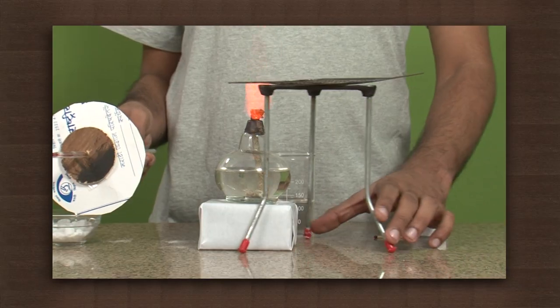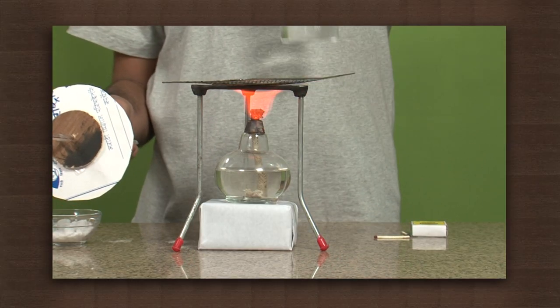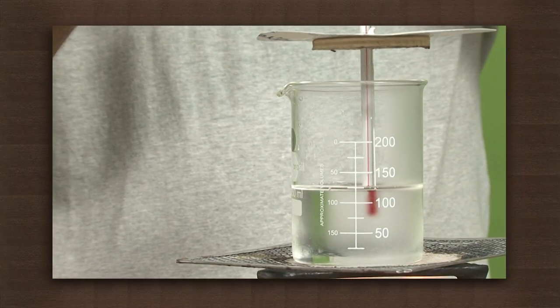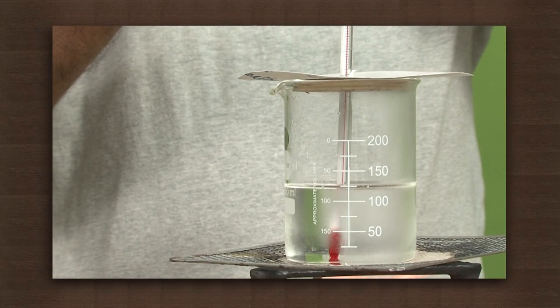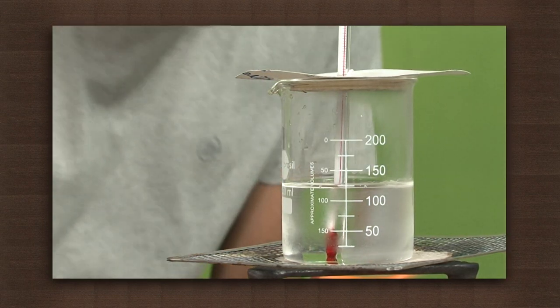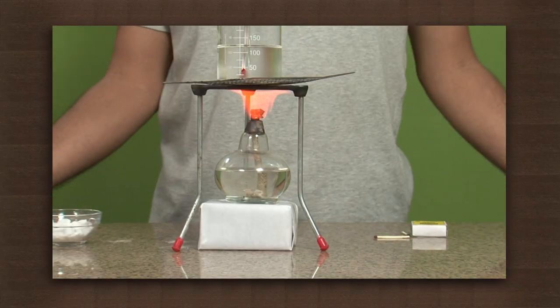Now place the stand above the lamp and keep the glycerine beaker on it. Note the initial temperature — it is 26 degrees Celsius.